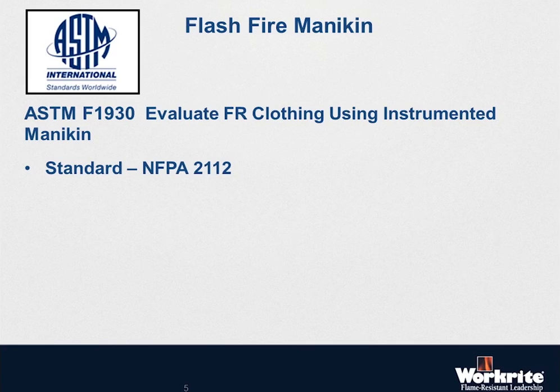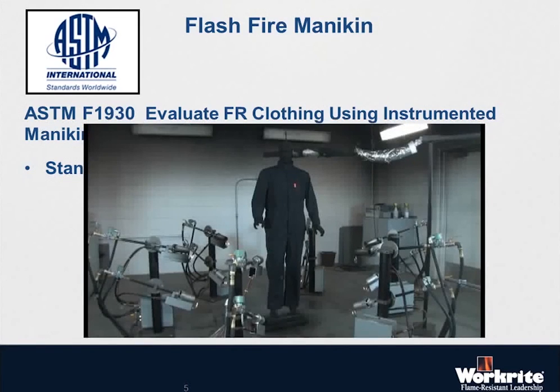It's run at 2 calories per square centimeter of heat flux. It's run for 3 seconds in requirement for NFPA 2112, and then it's measured to give you some kind of a predicted body burn percentage based on the testing and run up against the skin burn model that's part of the calculations for the predicted body burn. And here's a sample. You can see the mannequin is dressed in a standardized coverall in the middle. It's got multiple propane burners around the perimeter that have been calibrated to produce the right amount of heat generation, and then it is run.